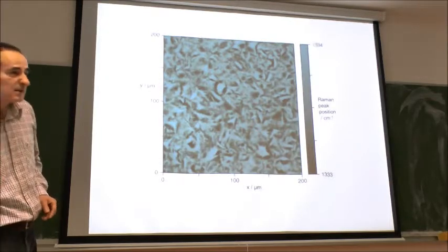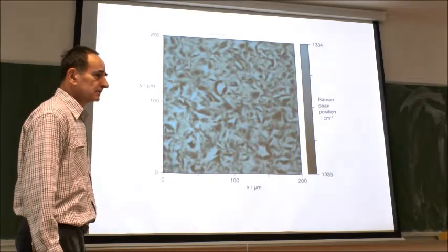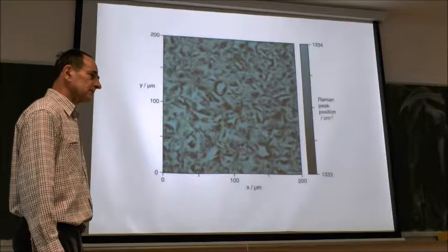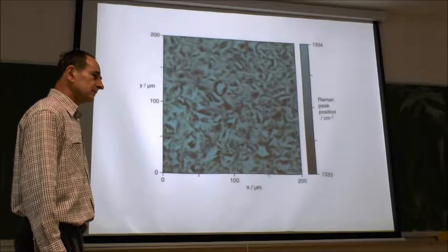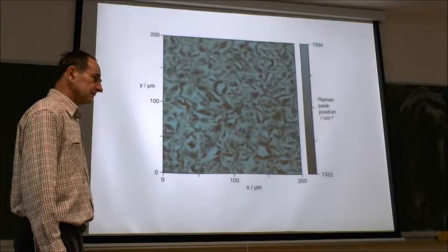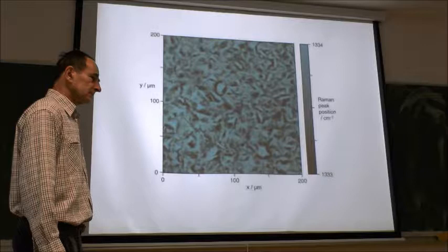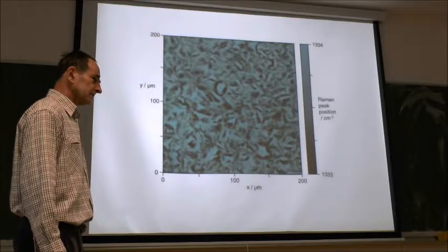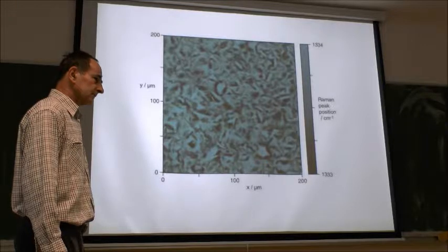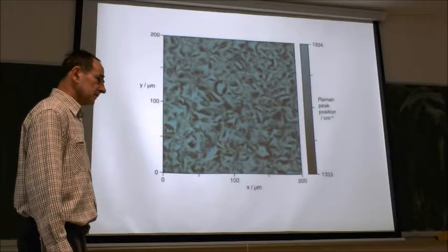So, I'm interested in the last image, which looks quite interesting for many studies. What is the resolution, let's say, in microscale? Suppose you have a heterogeneous sample that is composed, not necessarily of different material, but rather a shift in the Raman bands, and it is arranged in space of, let's say, 5 to 10 microns spatially. Would that instrument be possible to see the variation in the Raman band on that level?